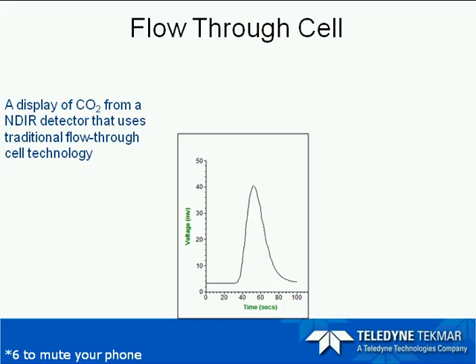And what happens during that analysis of the CO2 is that inside the detector, the amount of CO2 increases and decreases over time, as you can see on your x-axis, the time. And so at the end of that analysis, all that area underneath the curve has been integrated and accounted for. That area count is then converted to parts per million of carbon inside the sample.